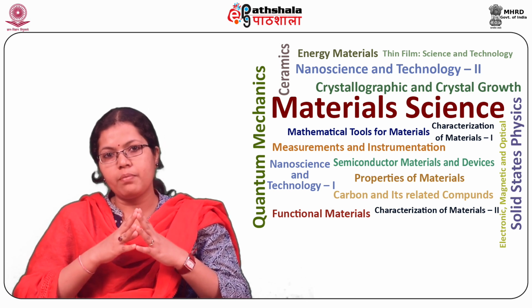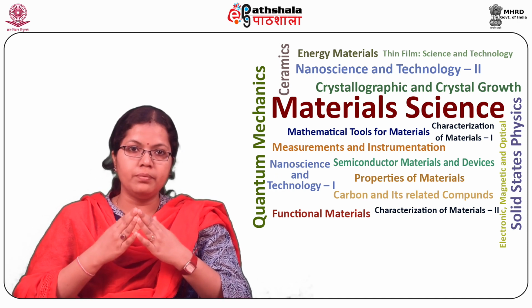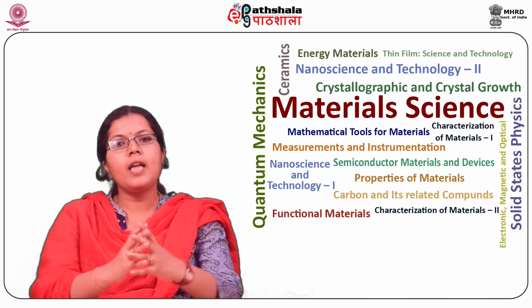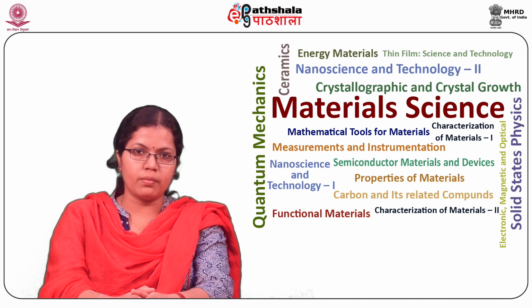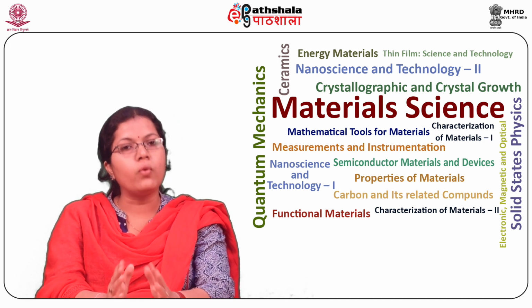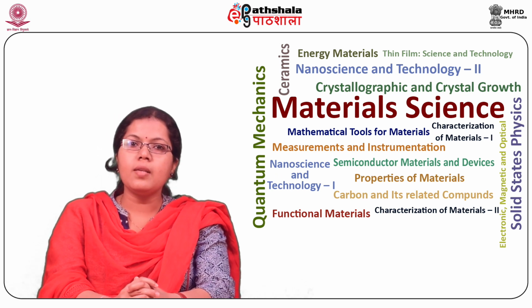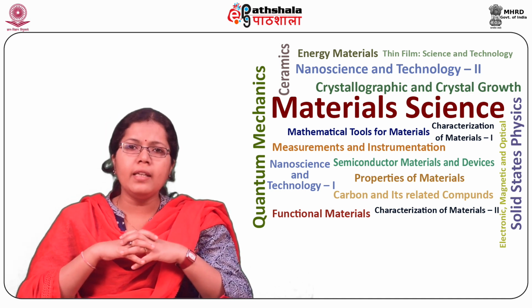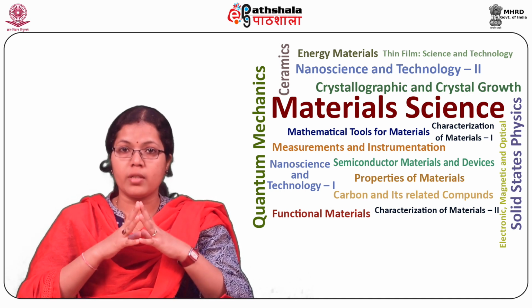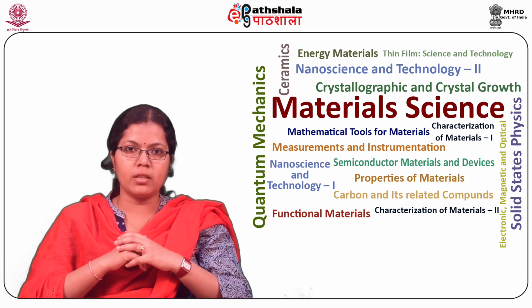A field emission tip can be cooled or thermally assisted to help overcome the work function. The temperatures are lower than those required for thermionic emission. The process requires very good vacuum. A simple tungsten tip can be very sensitive to surface contamination. More than any other cathode design, the field emission tip is extremely sensitive to the size, shape, and surface condition.